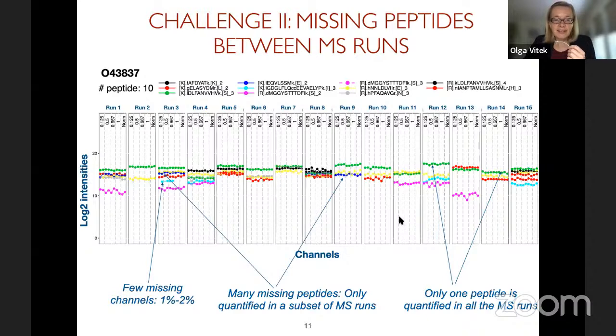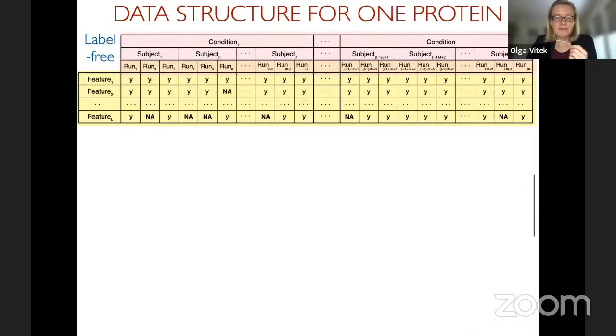And so this is the biggest challenge for us, because now not only the intensities shift between the mixtures, but also we don't even get to see the same ions, and they have different ionization efficiency and different properties. So how can we integrate the information across multiple mixtures to still distinguish these artifacts, which are due to data acquisition, from the actual true biological signals? So this is the objective of MSstatsTMT. And so now let me contrast the label-free versus label-based workflows from a statistical perspective.